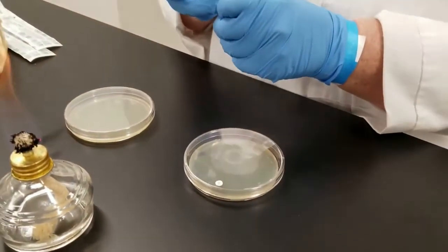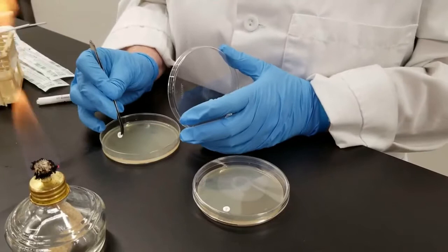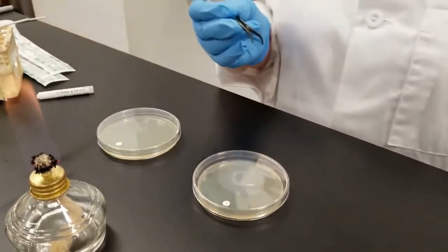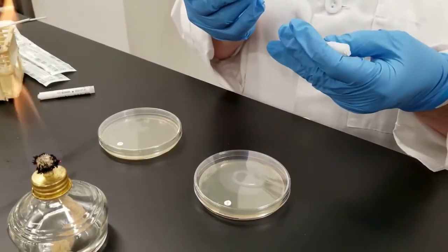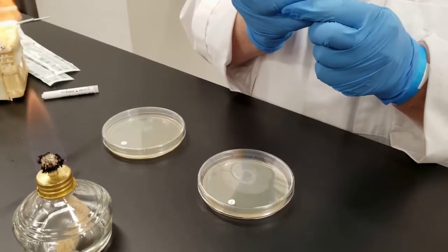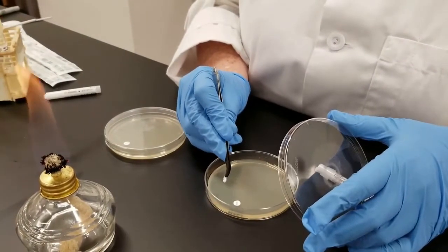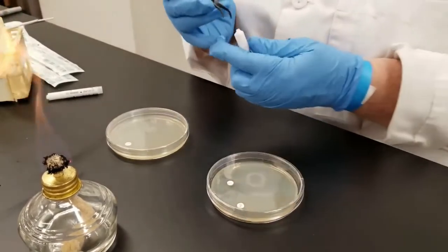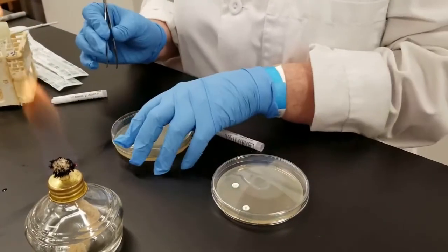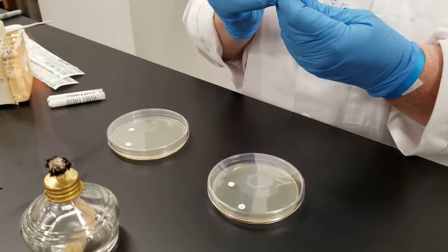We're going to use the same antibiotics on each plate so that we can compare the gram-positive to the gram-negative. These discs have been pre-soaked or impregnated with the antibiotic at a certain concentration. That's what the number is for. Like this one says 15 on it. It's usually referring to micrograms. So what happens is the antibiotic will diffuse out from the disc into the medium, and because we've already inoculated it, it will possibly inhibit the growth of the bacteria on that plate. So we'll just do this with all of them.